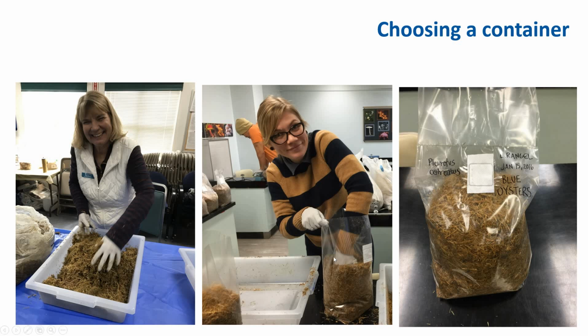The patch allows for gas exchange to keep out the dust, mold, and spores. So as we hand stuff the bag with pasteurized straw, we also sprinkle a little bit of the spawn on top of this. Once the bag is full, we seal the bag with a twist tie or use an impulse sealer that melts the top of the plastic bag together. So this is an impulse sealer, basically. The bag is stuffed. This bag is around 6 pounds.